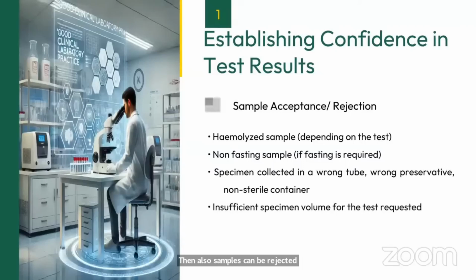Insufficient volume. Many times you will come across certain samples which require a specific minimum volume for those tests, and if the volume is not sufficient, then you may not be able to process or examine the sample. So in that case also you can reject those specimens.